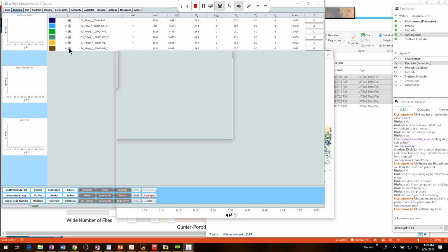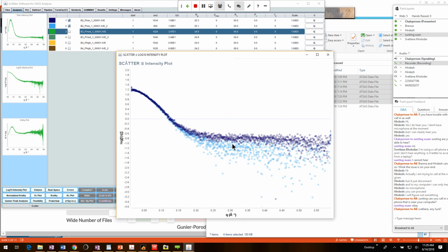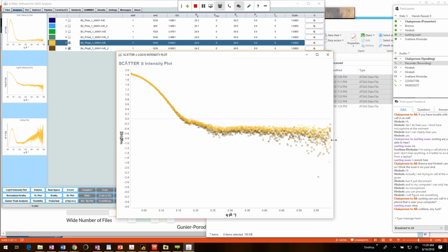So let's look at the most sensitive sample, which is low. So here's buffer 1, buffer 2, and there's some disagreement here. But again, it's sort of the noise area. Looking at the high concentration, which is going to be the least sensitive to this kind of problem, here's the level of agreement.